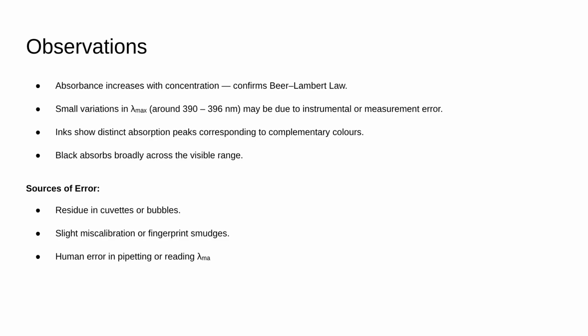So, like I said, some of the results were expected based on the colors we had. And again, like I mentioned, black absorbs broadly across the visible range. So I wasn't too shocked with the results we got for black. I think those were pretty accurate.